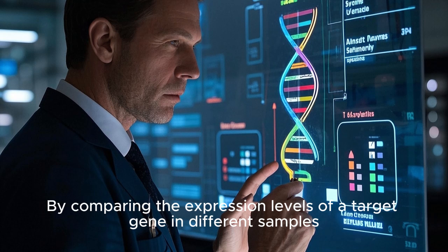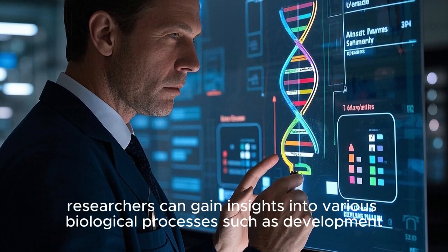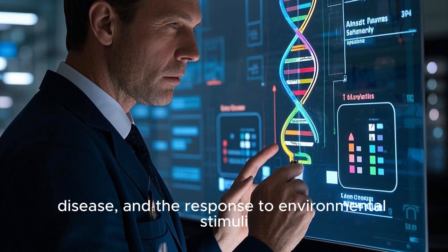By comparing the expression levels of a target gene in different samples, researchers can gain insights into various biological processes, such as development, disease, and the response to environmental stimuli.